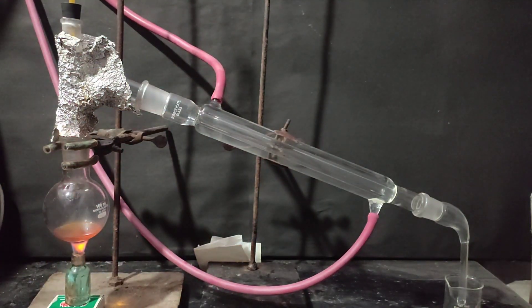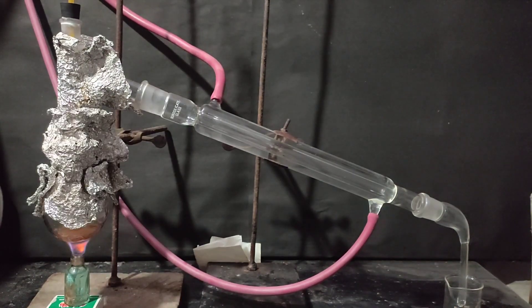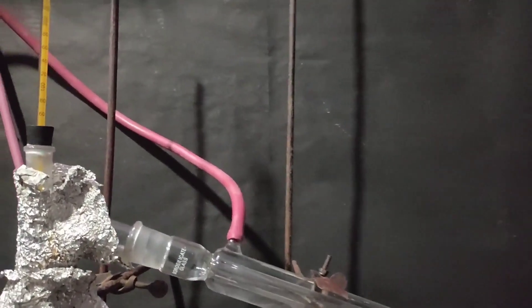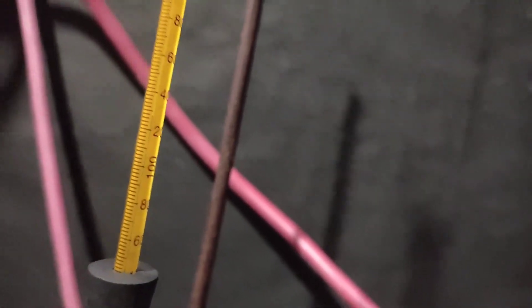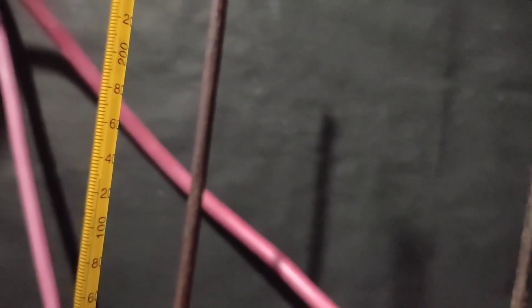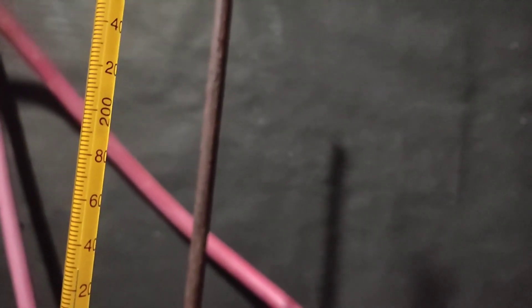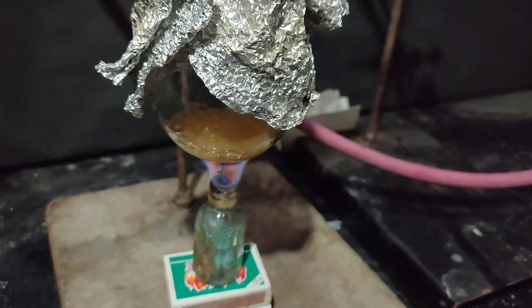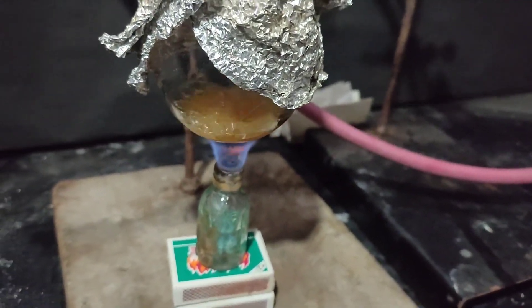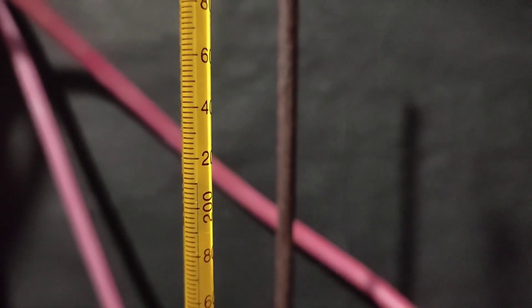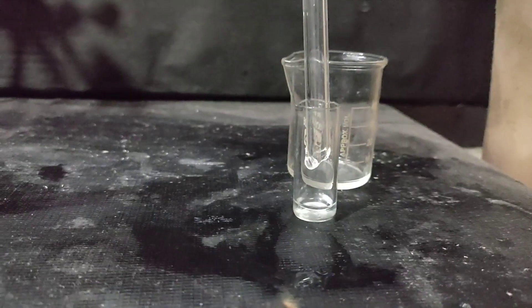The still head was insulated with aluminum foil. The receiver was changed and the flask was heated with spirit lamp. The flask was also wrapped up with aluminum foil. Benzyl alcohol boils at 205 degrees Celsius. So initially some distillate that came around 100 degrees C was discarded as it may be some water that would have remained. The distillate that came between 200 to 210 degrees Celsius was collected.